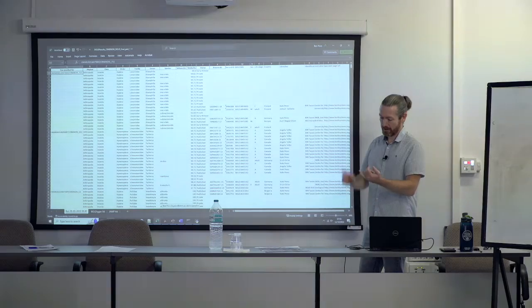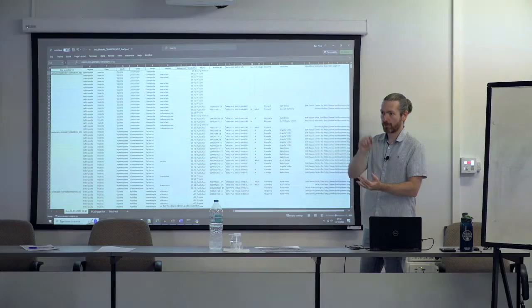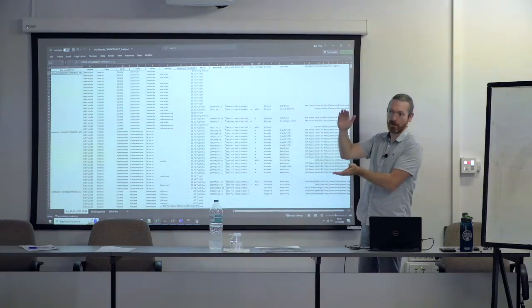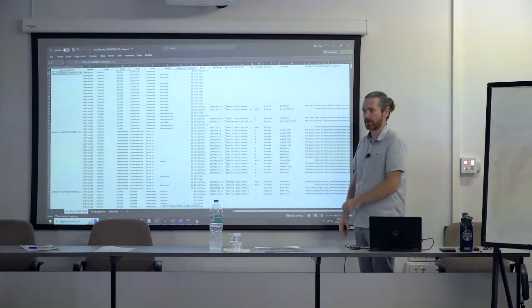Because then you can filter. You can say, right, it was identified by someone in this group. It has lat long, all of these other things, all the photos, trace files, all those sorts of things. Okay, what records match that? Pick one from each species, bang, there's your reference library.